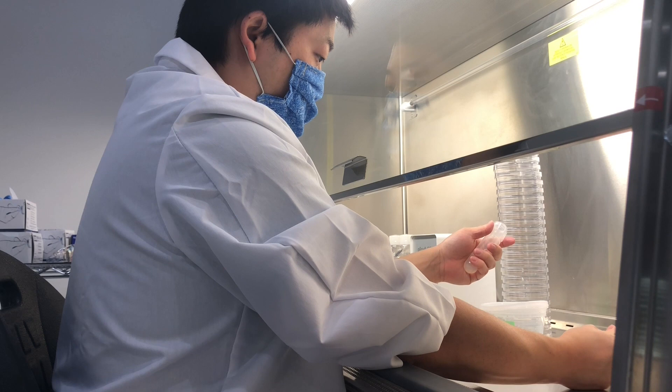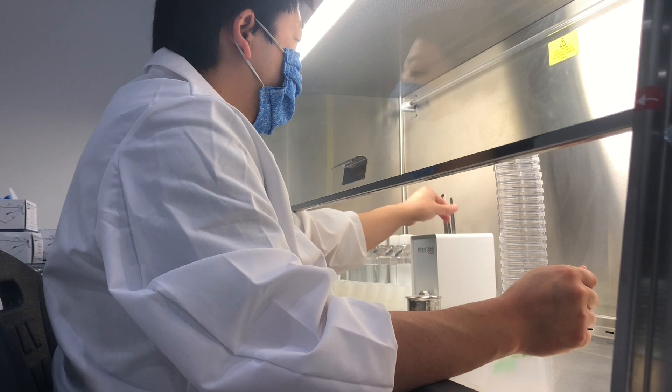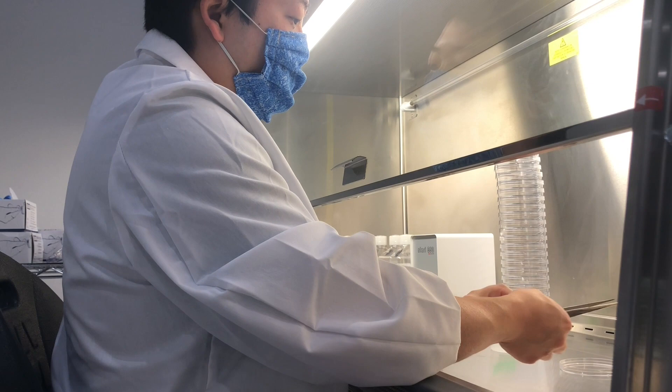Once our test tubes are ready, we can take the clean plant material and divide it into smaller pieces. We need to make sure that each section we cut has at least one node, which is what we call a joint in the stem. Nodes usually, but not always, have leaves growing out of them, which is typically an easy way to identify them.